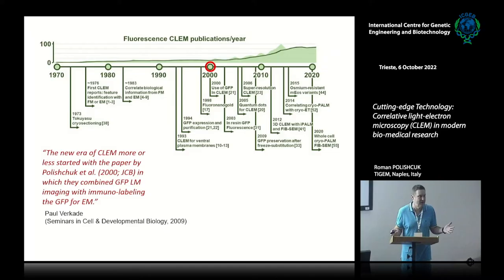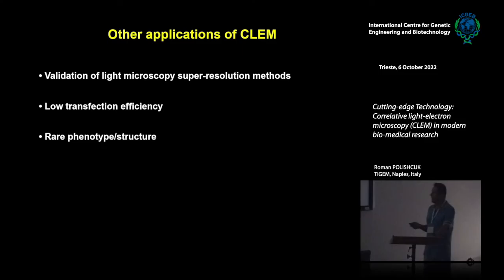although it's very technically demanding. But I would like to shift gears a little bit and to show you how CLEM could be used, not necessarily with GFP imaging, but for other tasks which would require its implementation. So one of these is validation of light microscopy super resolution methods. How do you validate whether your super resolution microscopy is good enough to see something at the light microscopy level? The control is electron microscopy. There is no way to control it in a different manner.